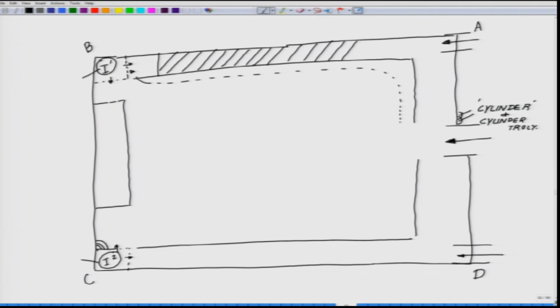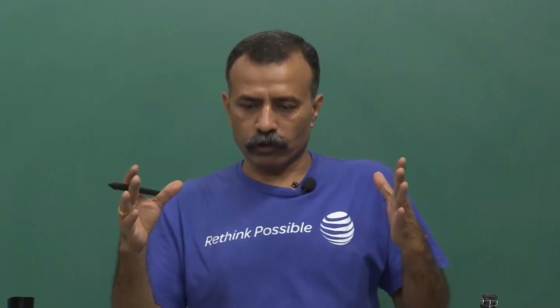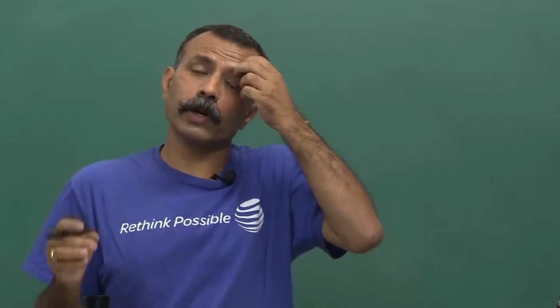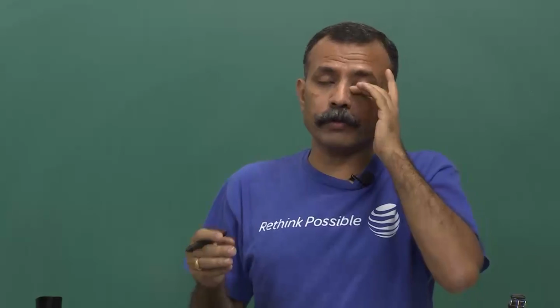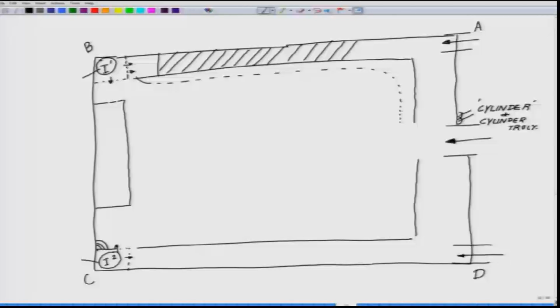Then I told you that you will have a nitrogen dewar. You should have 2 nitrogen dewars, one to store the cell lines, the other to bring the liquid nitrogen, because you cannot carry the parent one every time. So, you have to have a space, because every day you have to replenish nitrogen. So, you have to figure out where you want to put the nitrogen storage.